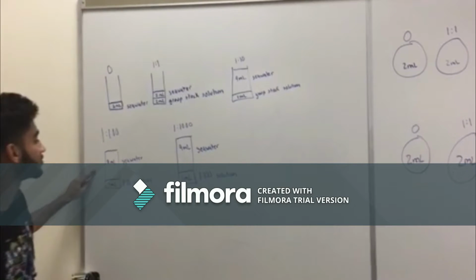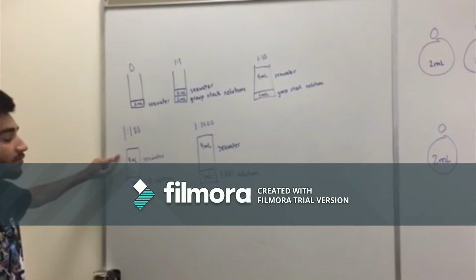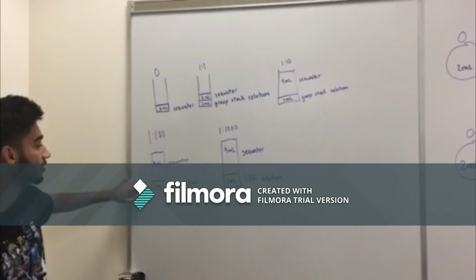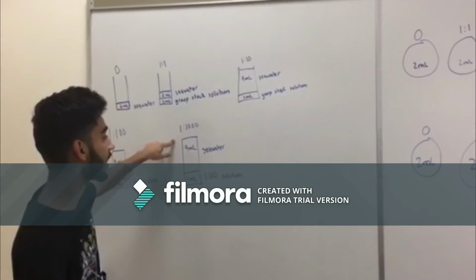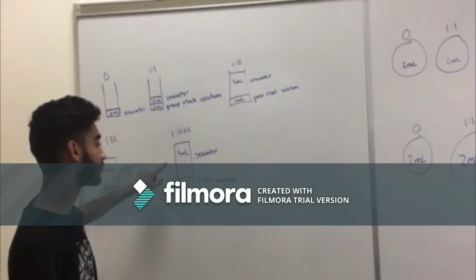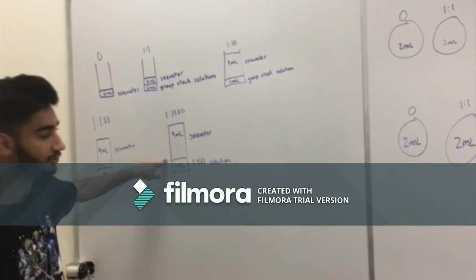Moving on, we have the 1-to-100 solution, 9 milliliters of seawater as well, but instead you have 1 milliliter of the 1-to-10 solution. So then the 1-to-1000 solution has 9 milliliters of seawater again, but this time it has 1 milliliter of the 1-to-100 solution.